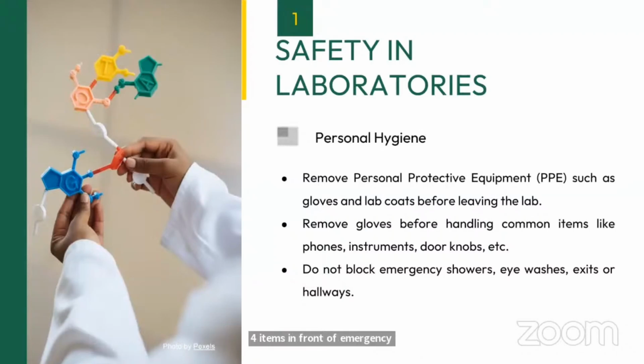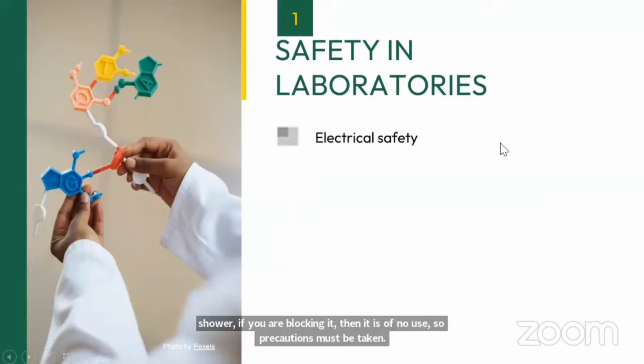So it is not accessible. So there is no use. Even if you have any eye wash or any emergency shower, if you are blocking it, then it is of no use. So precautions must be taken not to block any of these facilities.